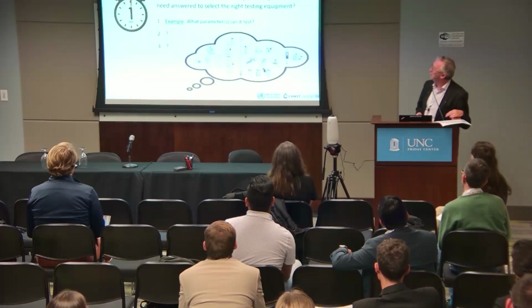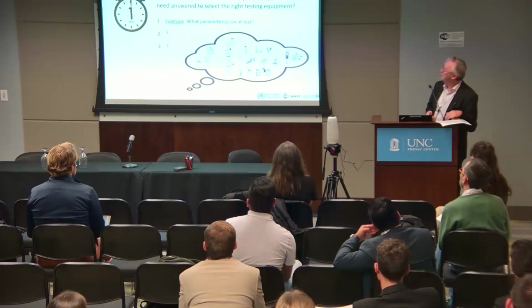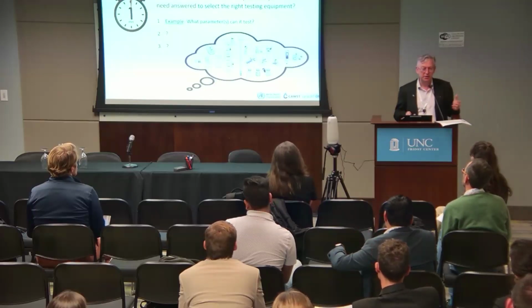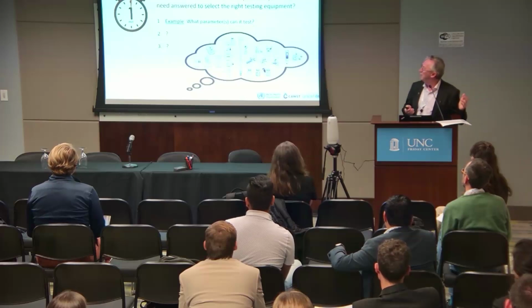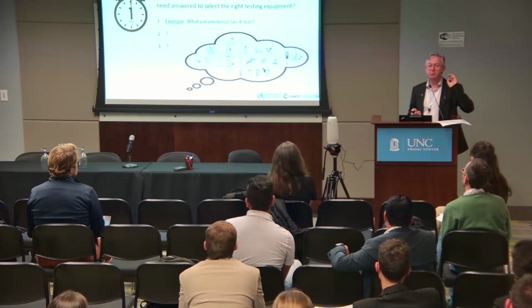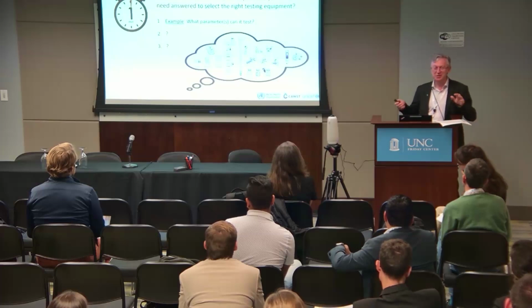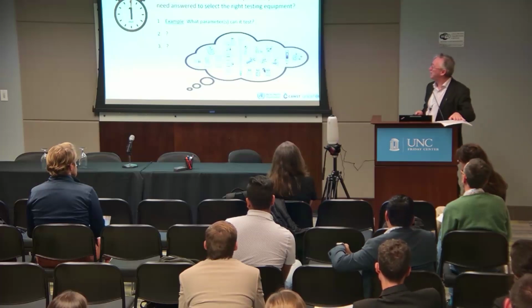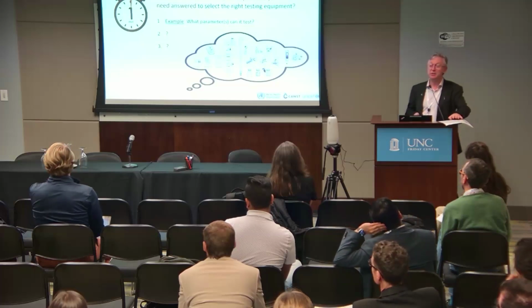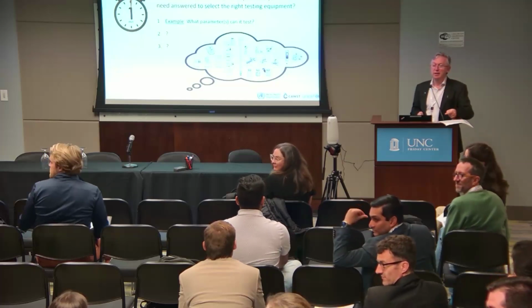So I want you to take 1 minute to think of two criteria you feel would need to be answered to select the right testing kit. An obvious one to start with is what parameter you can test. Maybe we can just do this with people shouting out. Don't feel shy, just shout, because we've got so little time to get through this. What do you think would be important criteria to help you in your selection of your field test kit? Whose job is it to test, and what are their incentives for doing it?